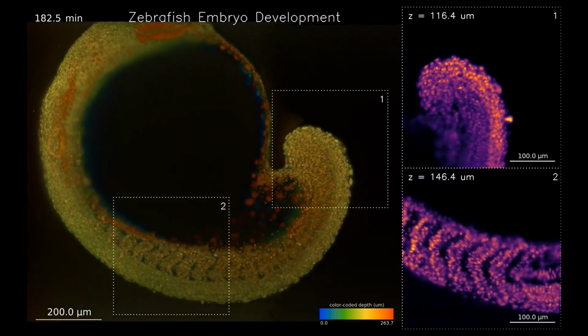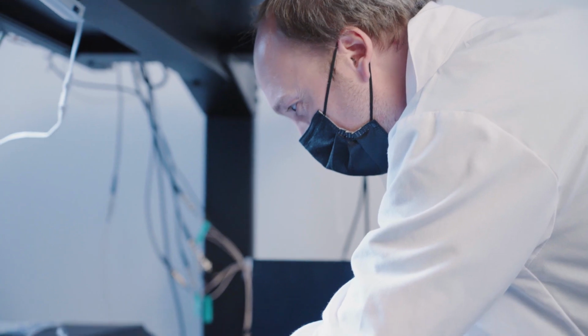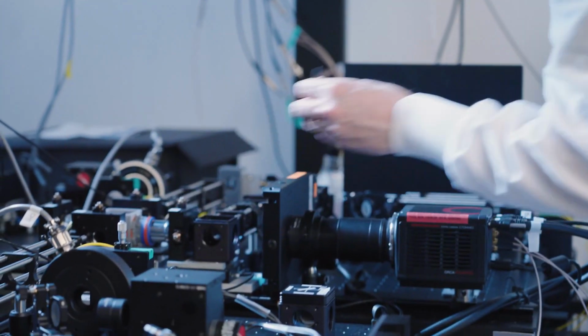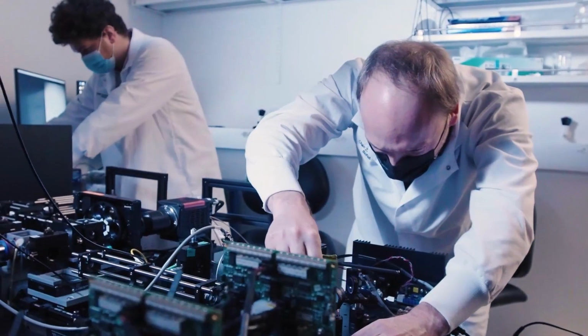Zebrahub is a set of imaging and sequencing datasets that basically span the development of the zebrafish embryo. Really what we're doing is biological cartography, and so we build microscopes. The reason why we develop new microscopes is because we want to push the horizon of what's observable.